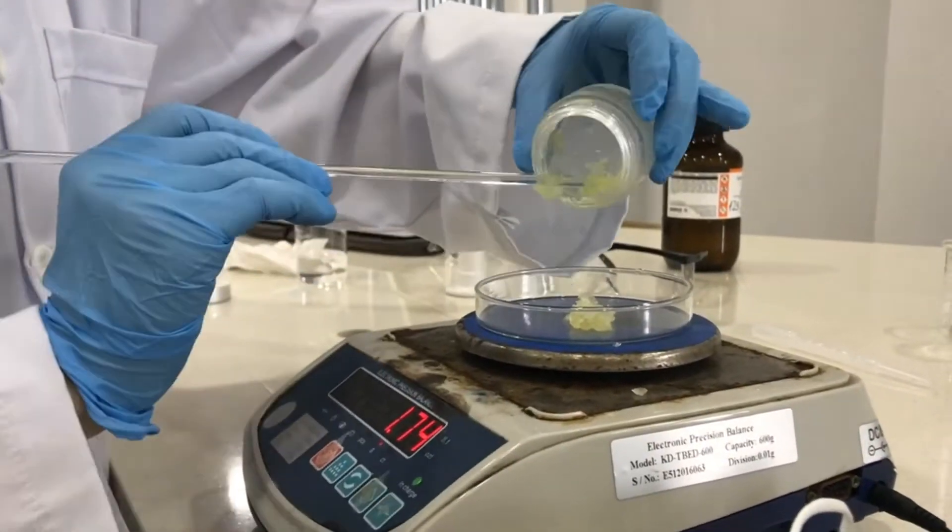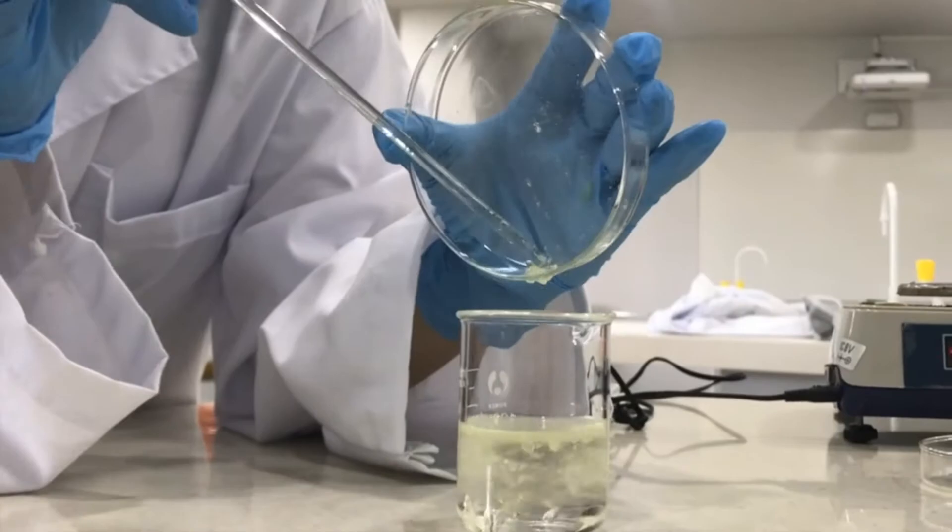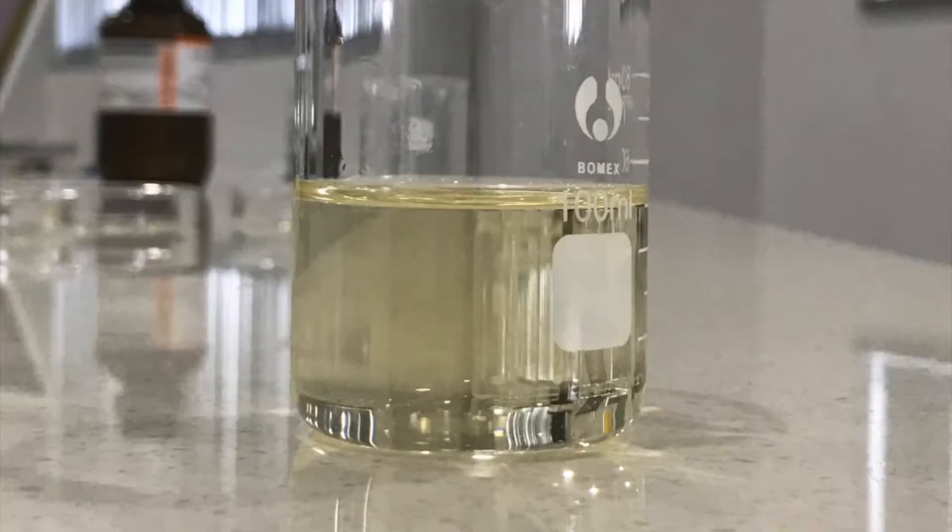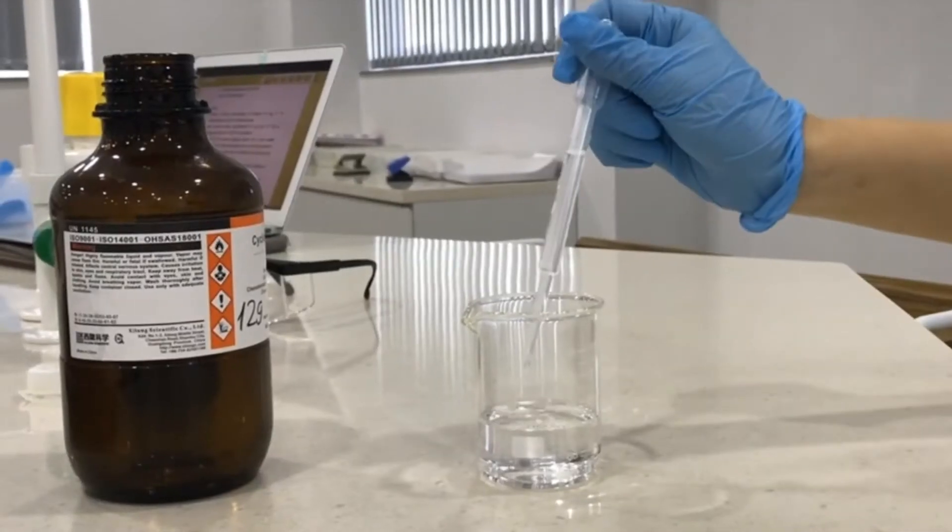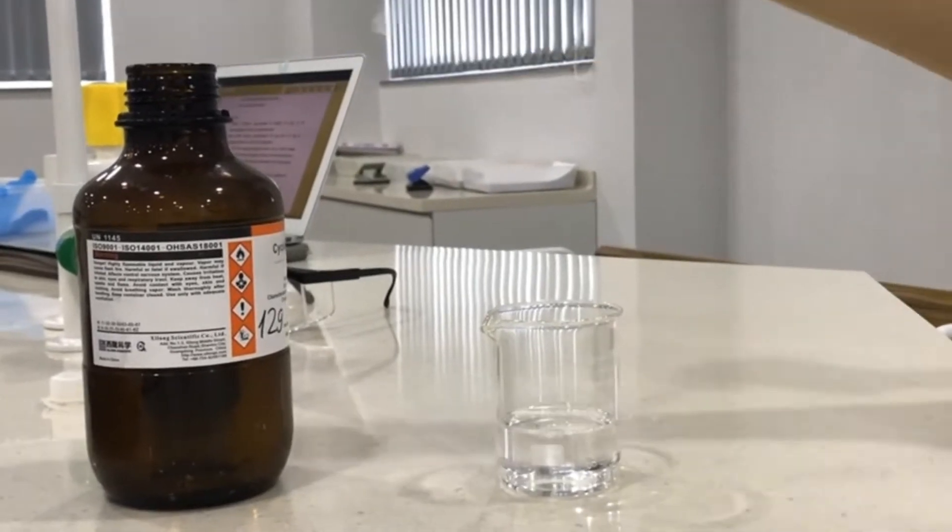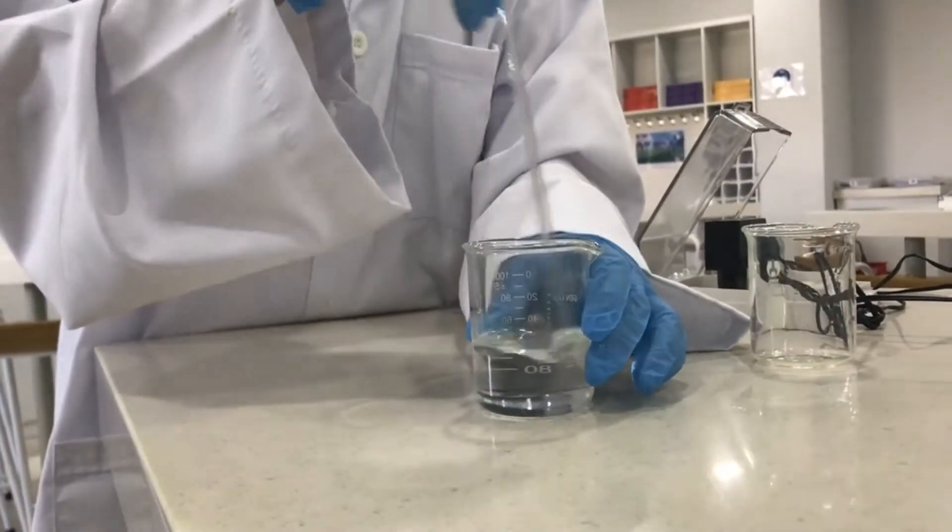First, make a solution of 2.2 grams of 1,6-diaminohexane and 50 cm³ of deionized water. Then make another solution of 1.5 grams of sebacol chloride and 50 cm³ of cyclohexane.